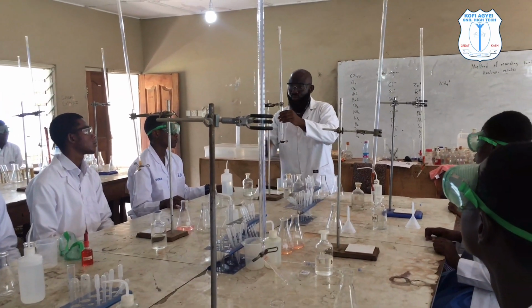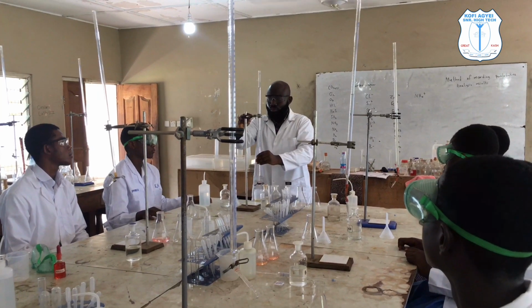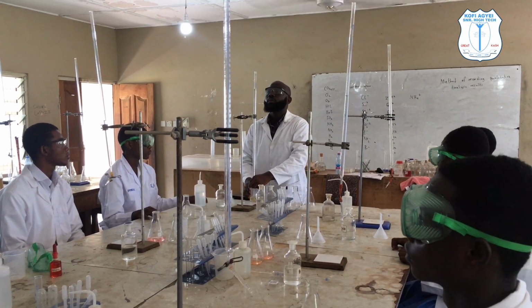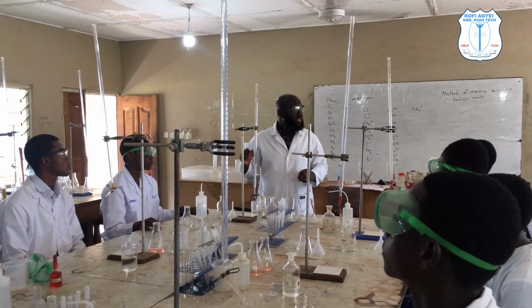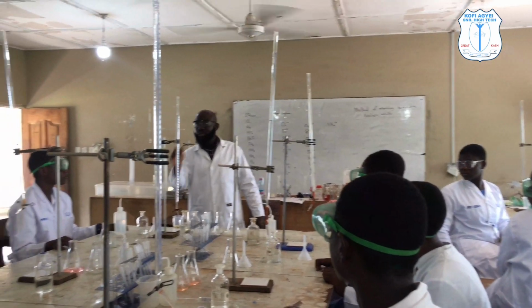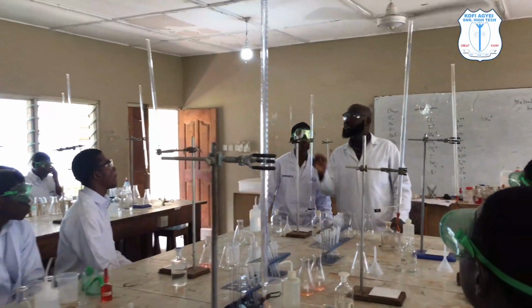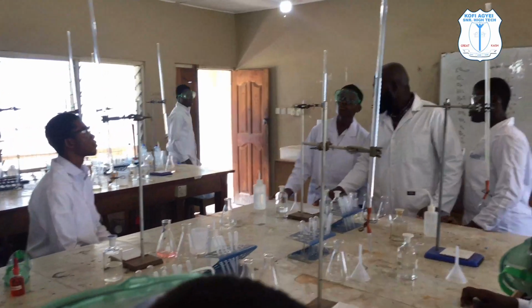So you can adjust it below. Now we take the reading from the bottom of the meniscus. You get the bottom of the meniscus. So one of you should come and check, just one for each bench. Now have you seen the reading? So bottom of the meniscus, understood?